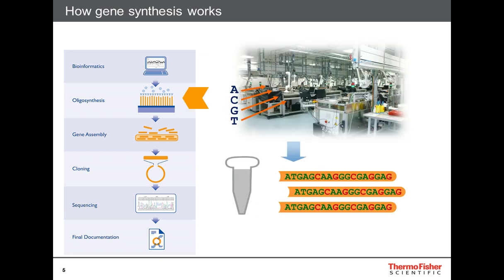That starts with oligosynthesis. We have apparently Europe's largest oligosynthesis lab here in Regensburg in Germany, but to date we entirely use it for gene synthesis. So here, of course, we have the 4 amidites, A, C, G, and T, and on the machines they are made into oligos which have a length something between 50 or 100 nucleotides.